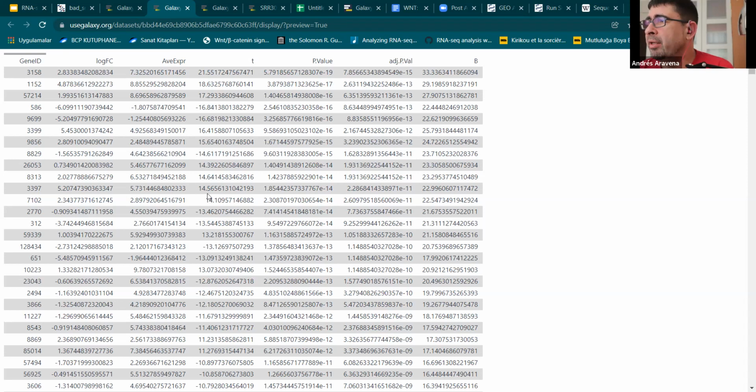And why 10? Why not? It's a small number. Everything less than 10 is small for sure. It can be 20 maybe, but you have to see that if the gene that appears more differentially expressed is something that you have seen very few times, it may be just noise. The differential expression may be noise. Anyway, keep going. Don't interrupt.